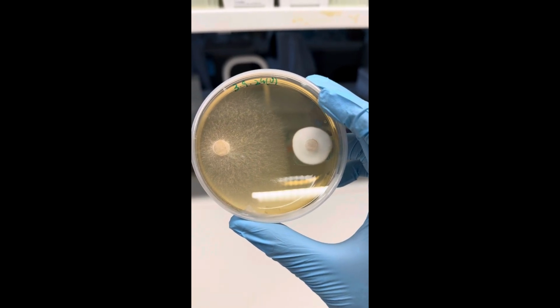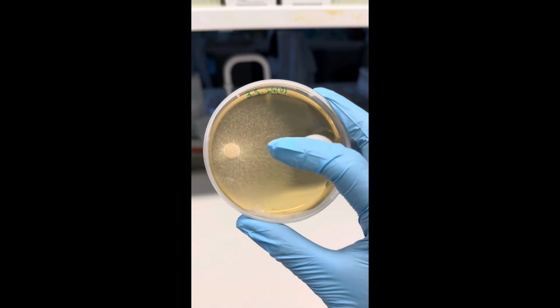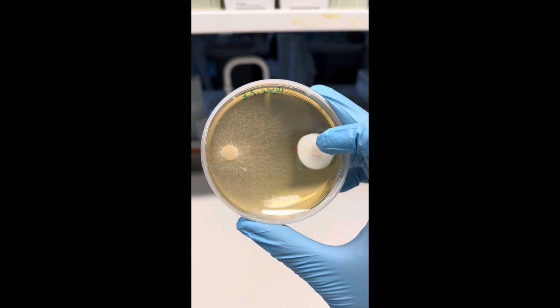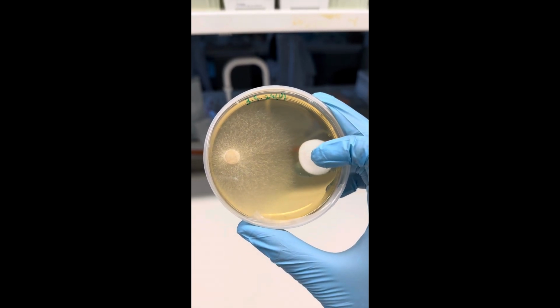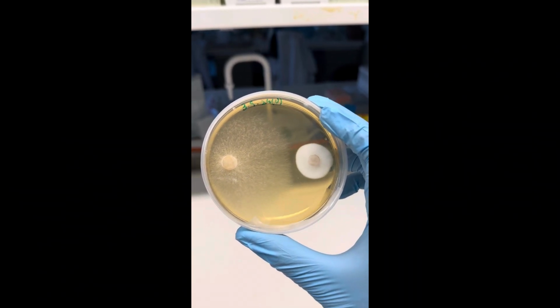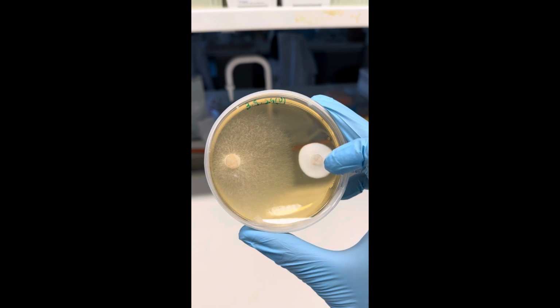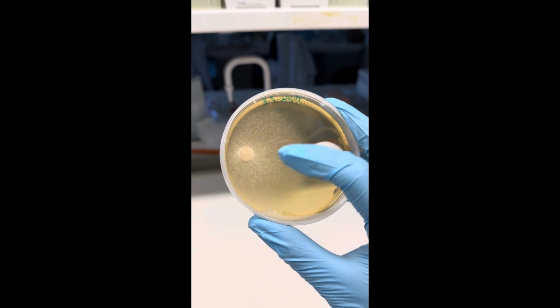But we have to wait a little bit more to confirm, because if Heterobasidion continues to overgrow it, then it means that they are not antagonistic. So we have to discard this treatment from our observations, because we are only interested in the other species if it can inhibit the growth of Heterobasidion.